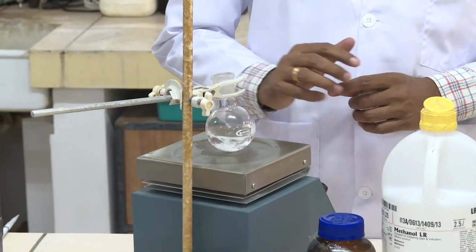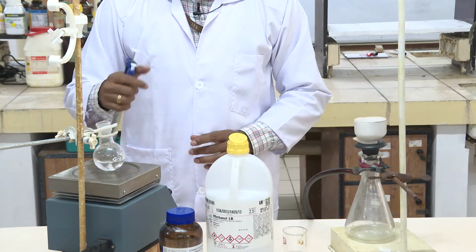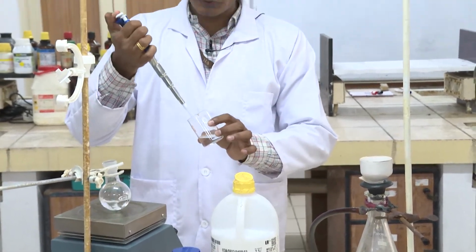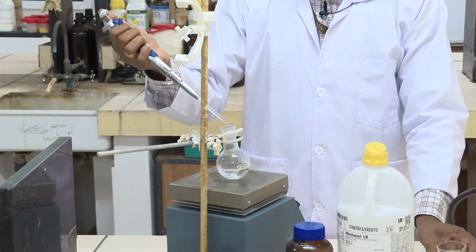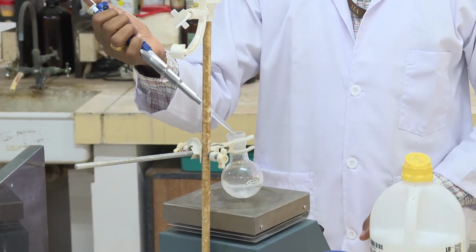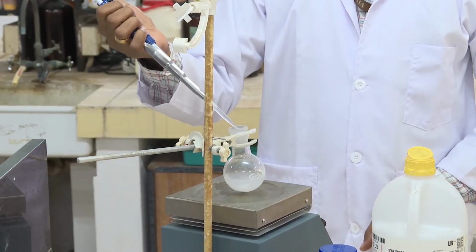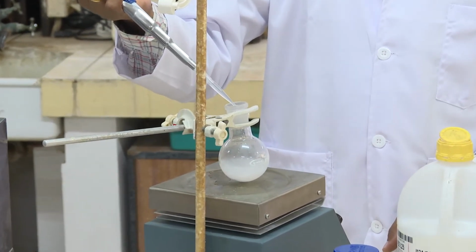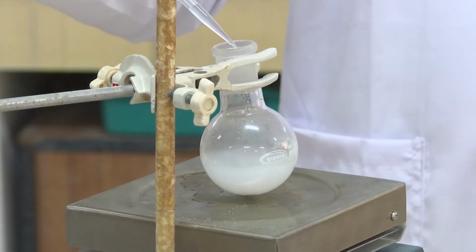You can see that the tin tetrachloride is completely dissolving in methanol. Now you can see that tin tetrachloride is completely dissolved in methanol. Now I am going to add 1.2 ml of aqueous ammonia to this solution dropwise to make sure that it will form a homogeneous colloidal solution. Now you are able to see that a colloidal solution is forming. You can observe that the reaction is so quick. You are able to observe that the tin tetrahydroxide is forming.